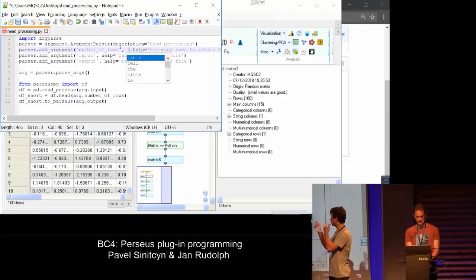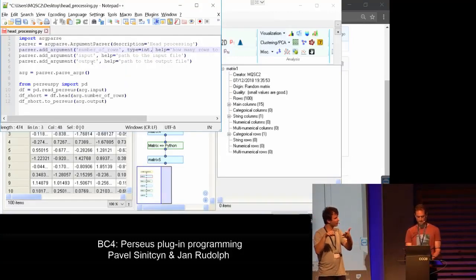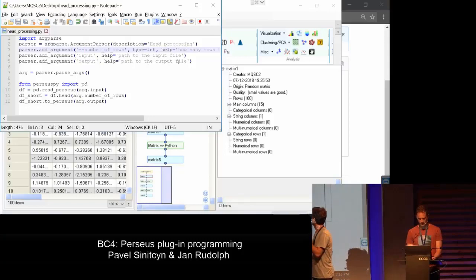But why can you not just write number of rows, minus number of rows? Can you do it or not? Yeah, I could do that. It's just much more intuitive, honestly. You can do it even now, without changing anything. Okay, I did it.